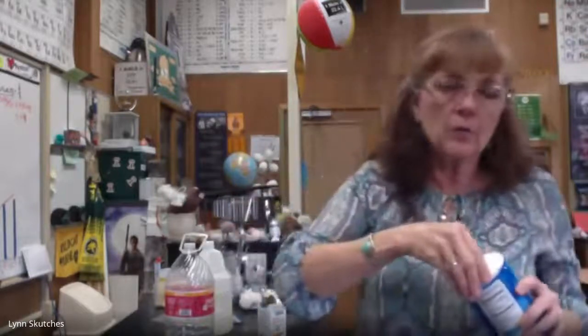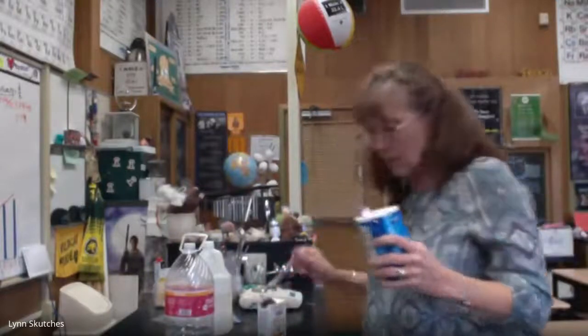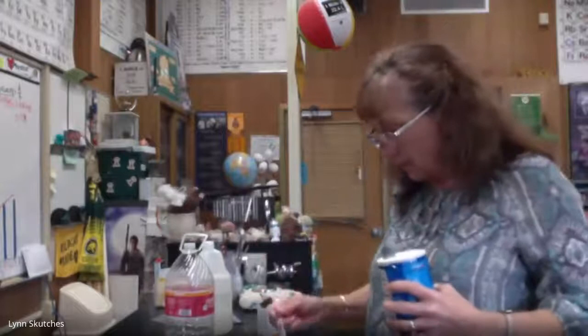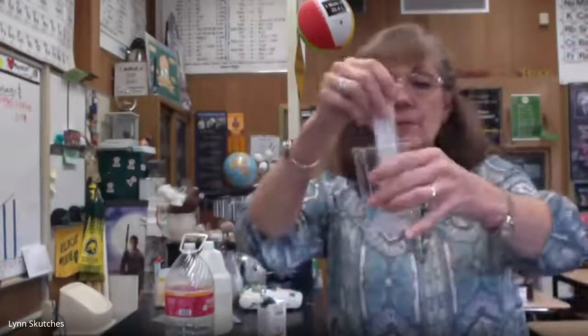Otherwise, just use a regular spoon and don't put a lot. But you're going to add some salt, about a half a teaspoon. This is kind of a big spoon, but put it in there, okay? And then kind of stir it up.